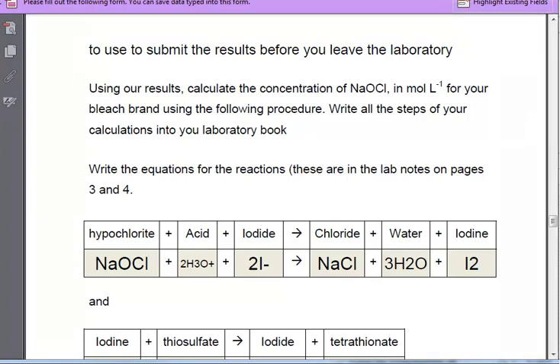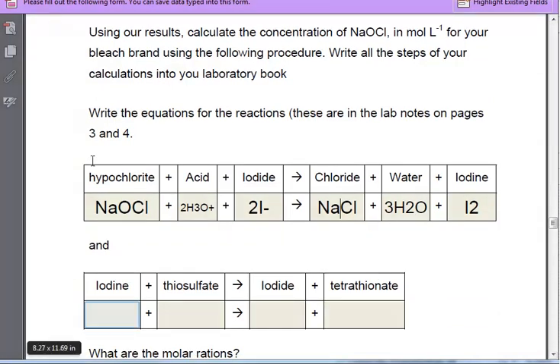And you see 1 mole of hypochlorite produces 1 mole of iodine. Then what we're doing, we're titrating the iodine with the thiosulfate. I'm afraid I can't put the superscripts in still into the computer program. It's the bane of computer programs writing chemical formulae.